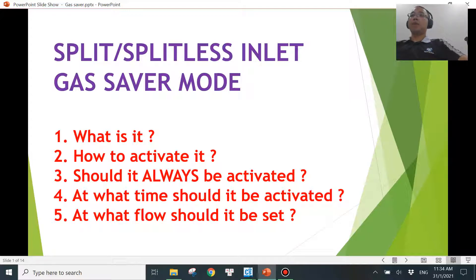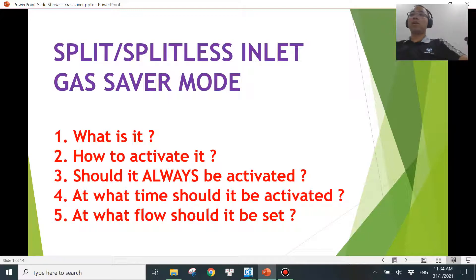The name already tells you that it's a way for you to save gas, especially when helium is running out very quickly and getting a lot more expensive right now. Agilent does provide a way for you to save gas for the split/splitless inlet. But believe me, every time you want to save something, you really want to understand what it is in order to save it correctly, because I have seen cases where a lot of things you have to pay back if you don't use it correctly. That's why I made this video to explain everything about gas saver mode.